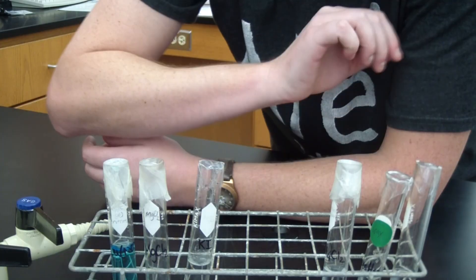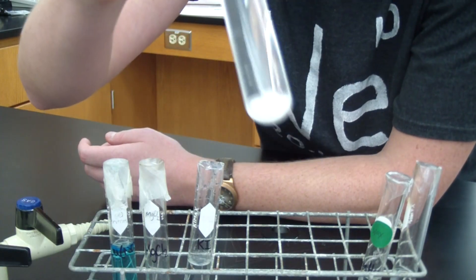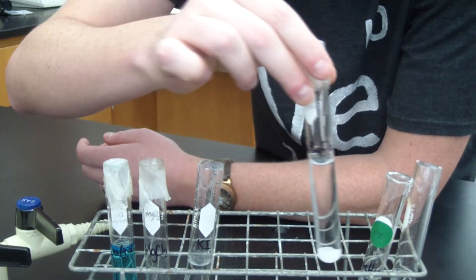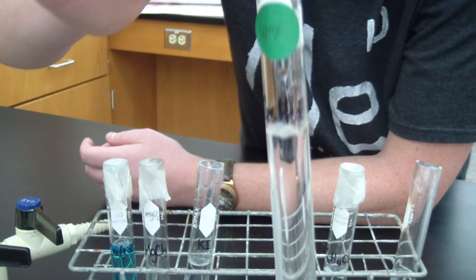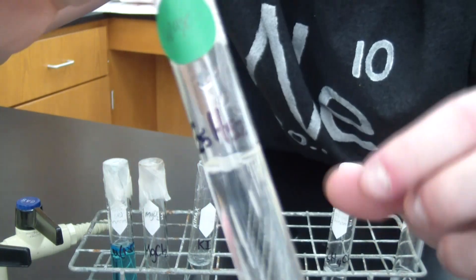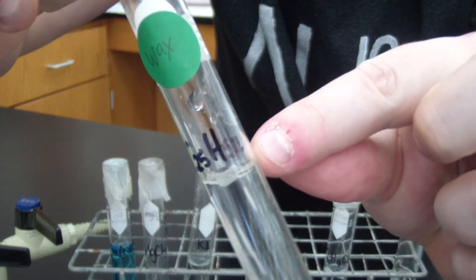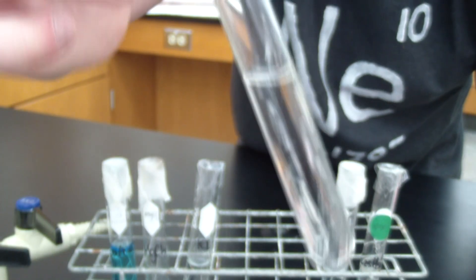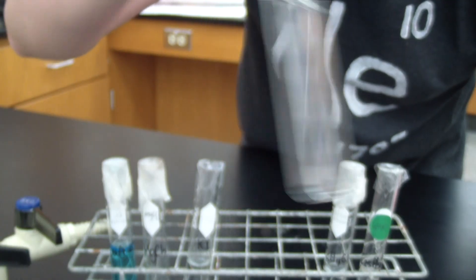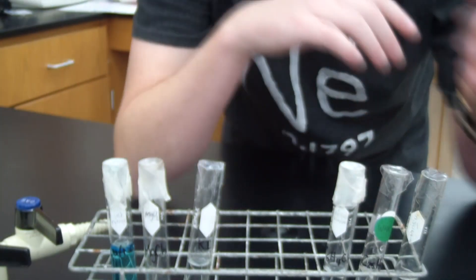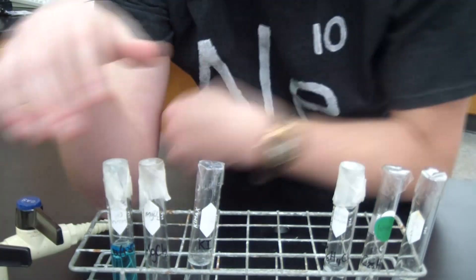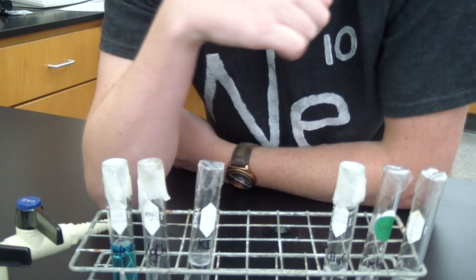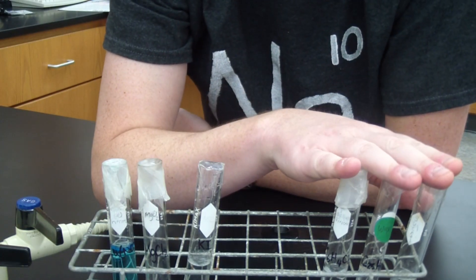Over on the other side, these are the covalent compounds. And as you can see, that one is not soluble. And this one, it's a little more difficult to see, but it's floating at the top right here, also insoluble. And this one, actually of these three, is the only one that is soluble. So as a general trend, the ionic compounds are more soluble in water than the covalent compounds.